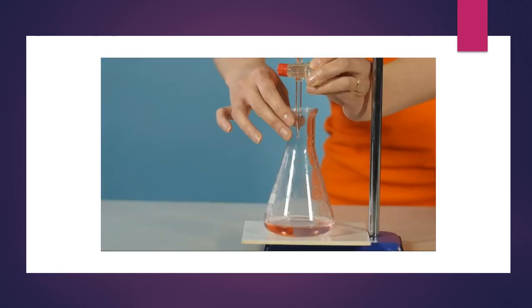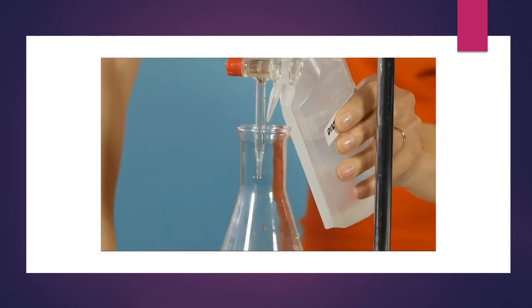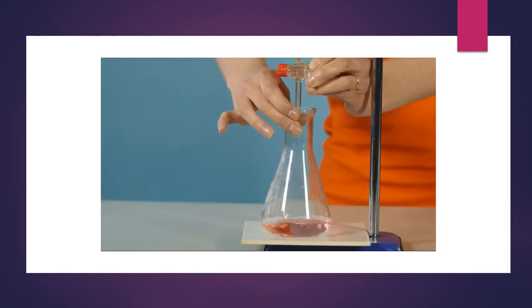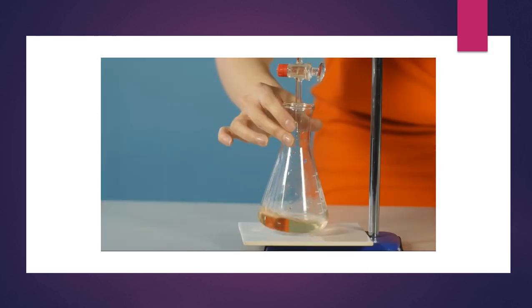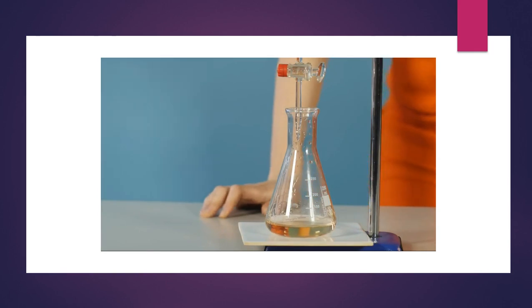While continuing to swirl, add the sodium carbonate solution drop by drop from the burette. After the addition of each drop, rinse the tip of the burette with distilled water. Swirl the flask, then rinse the sides of the conical flask with further distilled water. When a permanent colour change occurs, note the reading. Repeat the titration until two titers agree within 0.1 cm³. Once you've recorded your data, you should have all you need to calculate the concentration of the hydrochloric acid.